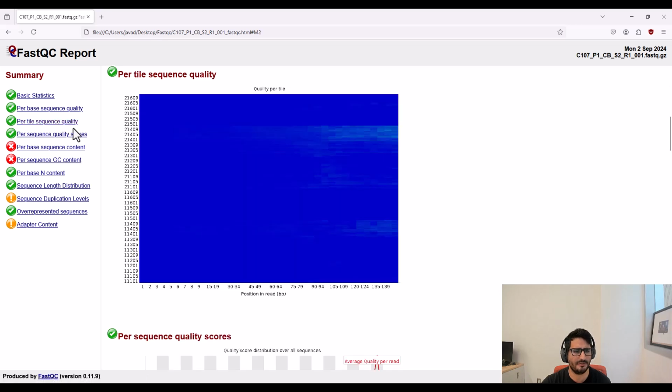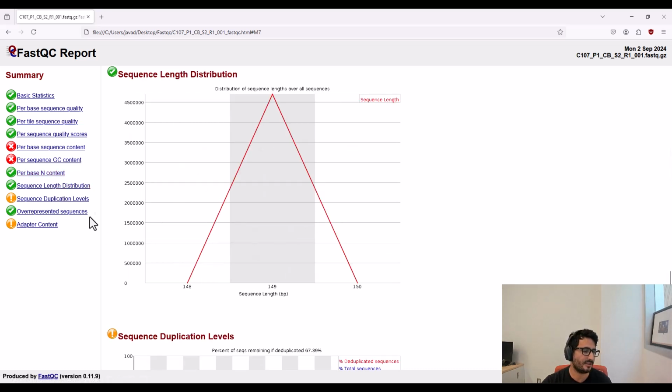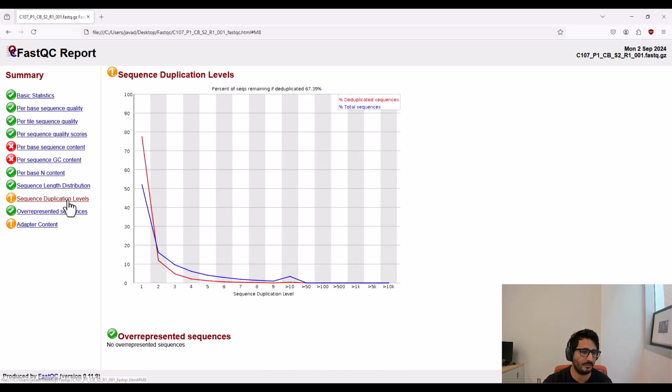There is some other information that you might need when you're analyzing your sequence file. For example, length distribution is another factor. If you get different lengths, that might be a concern that the sequencing wasn't properly run, or you might have some contamination.